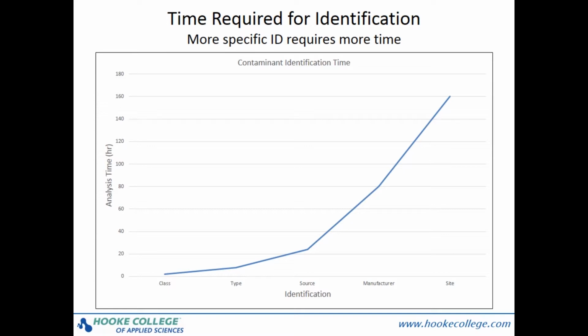That time may be warranted if it's a legal matter or has severe implications for the customer. But if the work is just for information, then knowing it is nylon may be sufficient. In many cases, the requester will ask for the maximum information, naturally. So you may need to be the one to limit the time spent and to exit the work appropriately. In my career, the requester never had to account for my time. Since there was no cost to him or her, they could ask for an infinite amount of my time, only a slight exaggeration. It was up to me and my management to manage those requests.